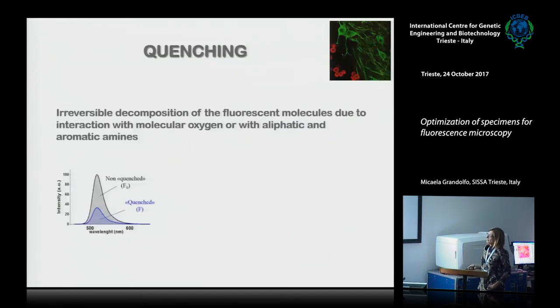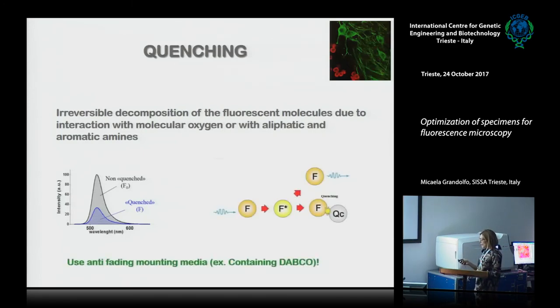So, just a few words about quenching. Quenching is just an irreversible decomposition of the fluorophore due to interaction with oxygen or with aliphatic or aromatic amines. In a very simple way, I would like to show you this cartoon. Suppose this is your fluorophore.